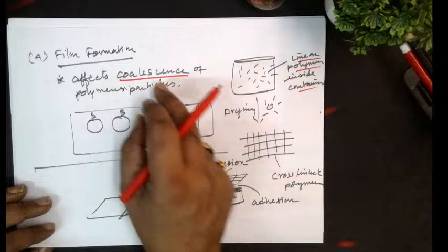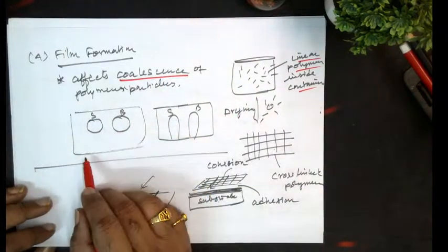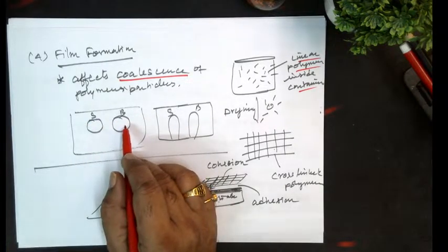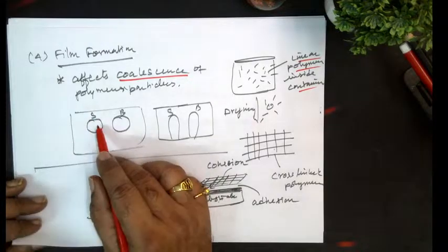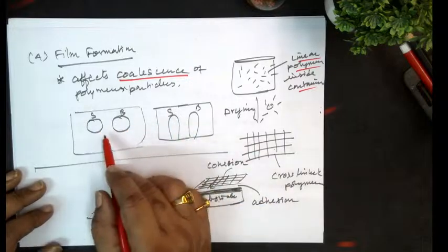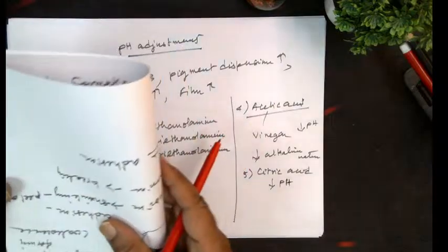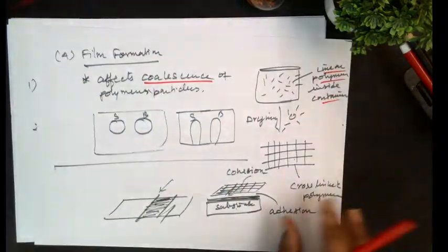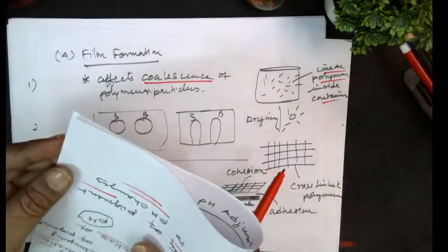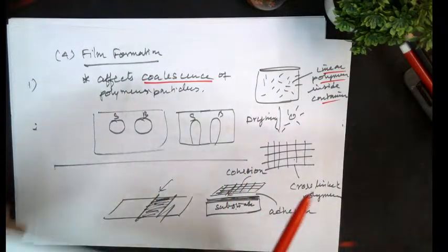And the flow can be checked by taking the standard solution and the bulk batch. Put a few drops, or one small teaspoonful, of the solution, the paint or the resin, on a transparent glass plate and just tilt it. It can be of postcard size. This is A4 size; fold it, and you can use a glass plate of this size.